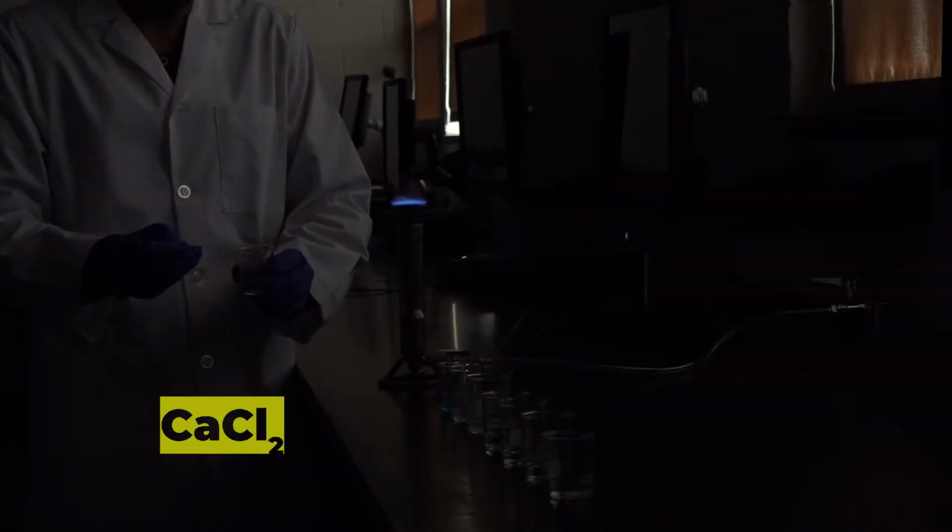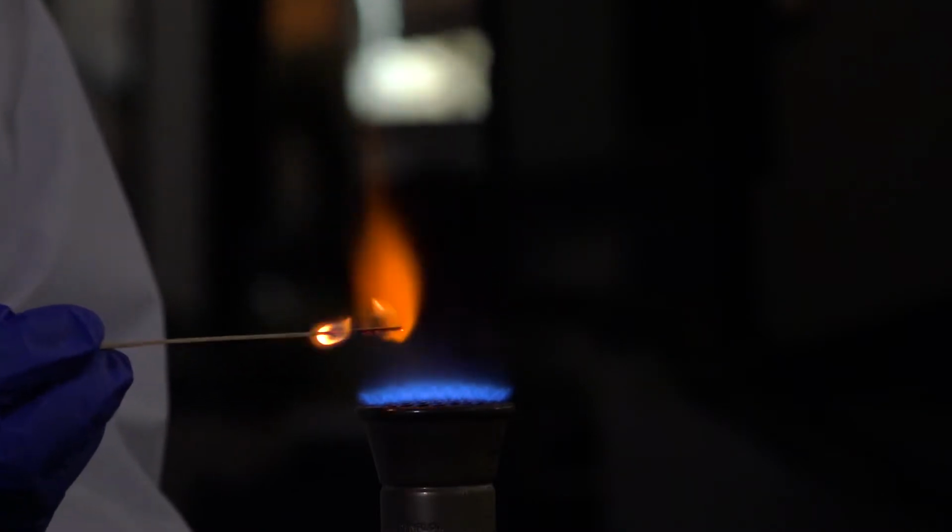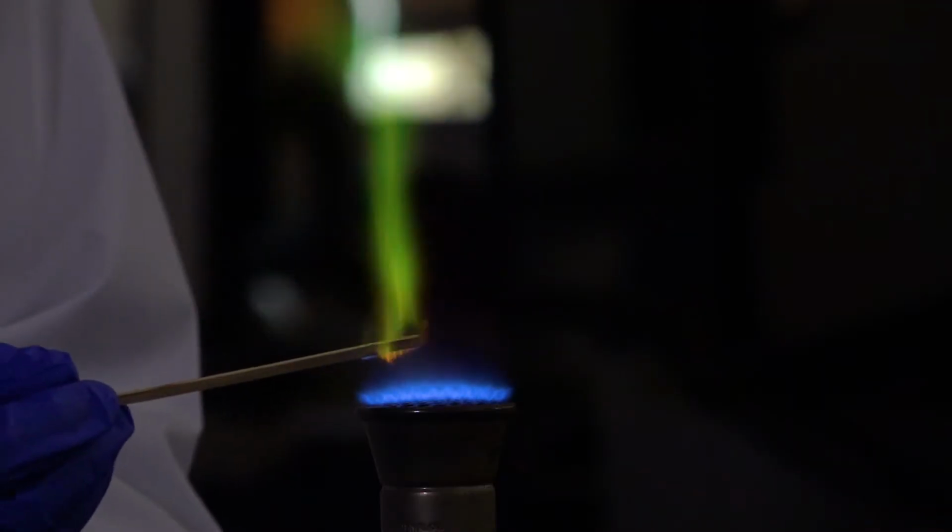So let's see what happens when we introduce calcium chloride into the flame. You can see that it has an orange color. Now we're going to test out copper sulfate. See that it has a yellow, greenish color to it.